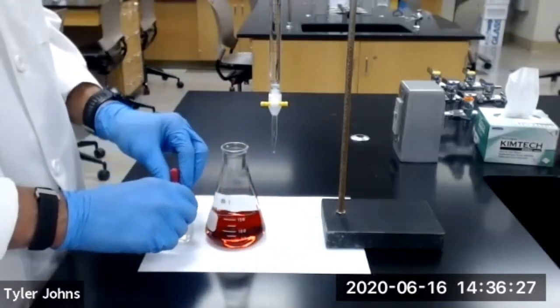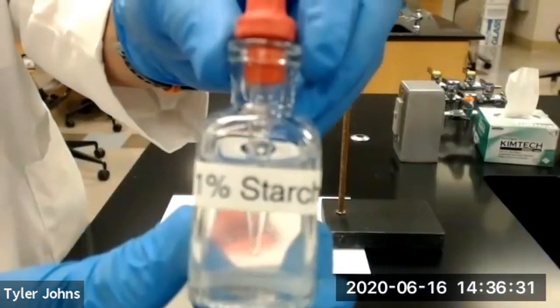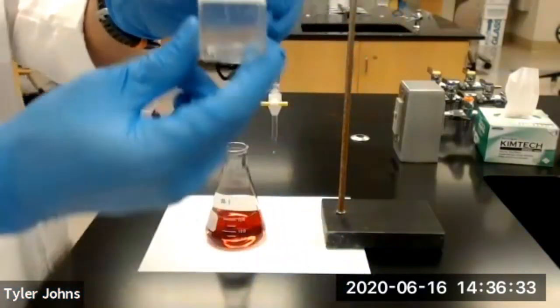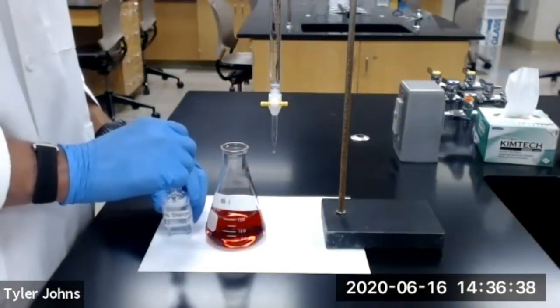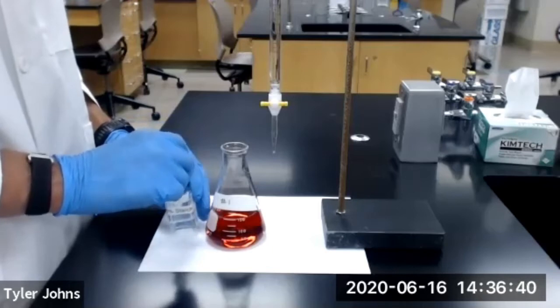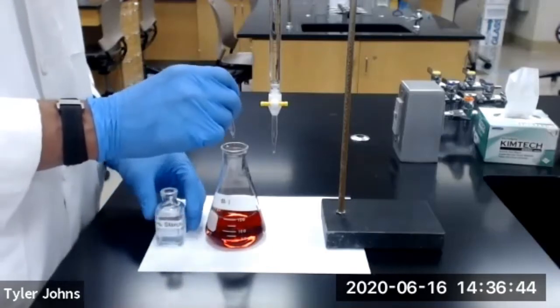Next, we will dropwise add 1 milliliter of 1% starch solution to the titration flask until the mixture develops a blue color. Remember, we're adding this dropwise with mixing.